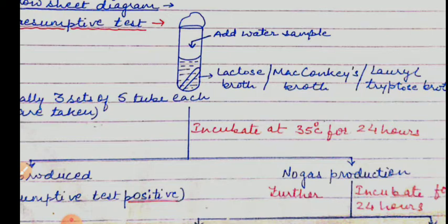Which broth? Either lactose broth or McConkey's broth or lauryl tryptose broth. The medium contains an indicator whose color change will tell us whether the organism has produced acid from lactose or not.